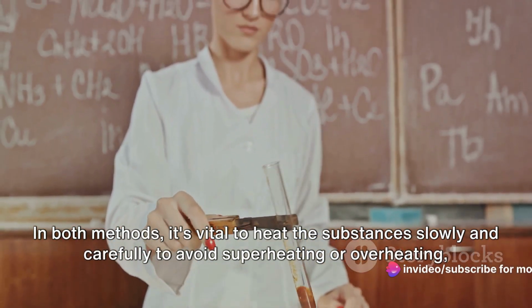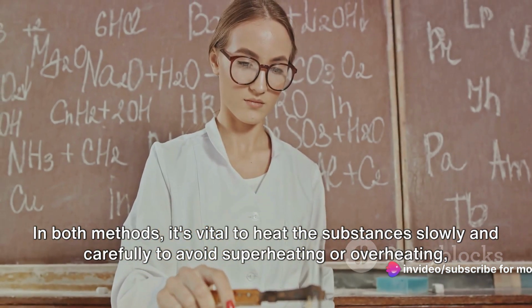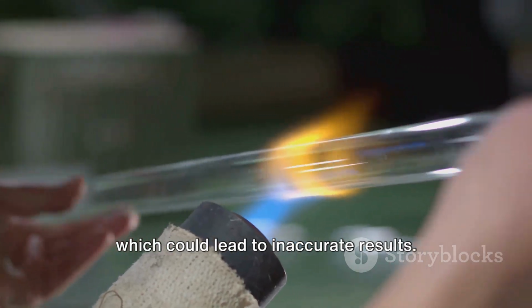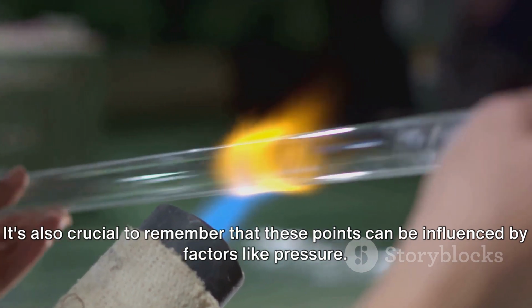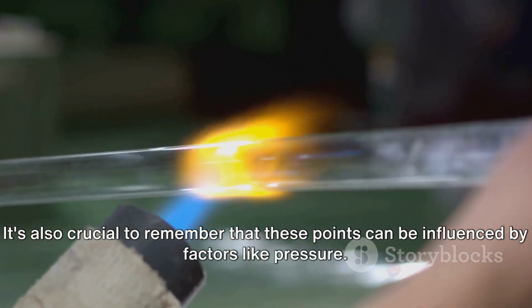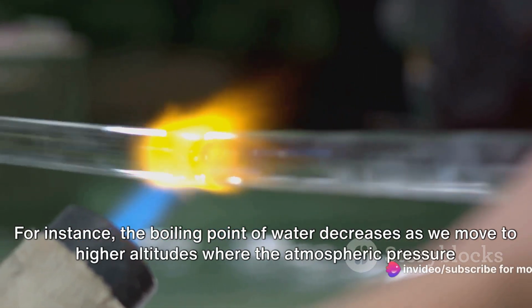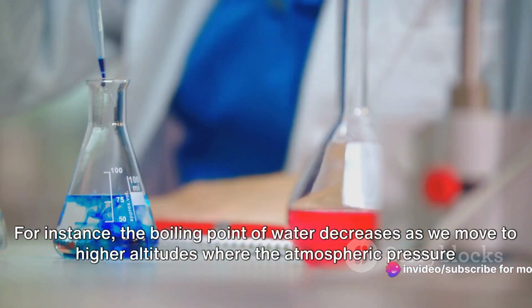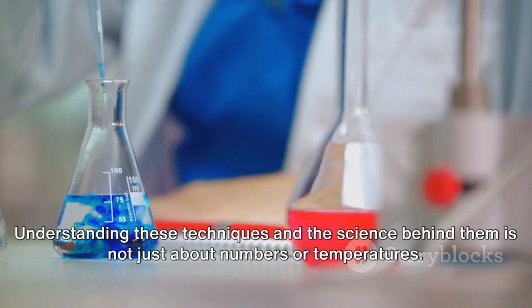In both methods, it's vital to heat the substances slowly and carefully to avoid superheating or overheating, which could lead to inaccurate results. It's also crucial to remember that these points can be influenced by factors like pressure. For instance, the boiling point of water decreases as we move to higher altitudes where the atmospheric pressure is lower.